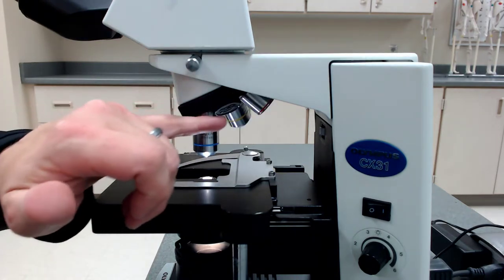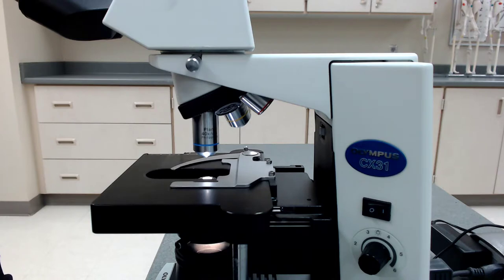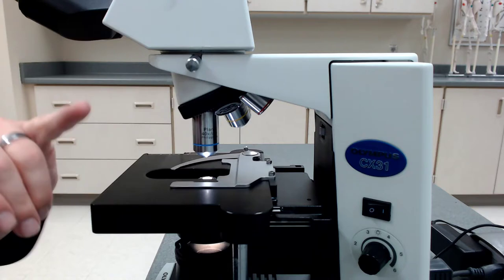So as you can see, it's been removed. But the oil immersion objective would be 100x. Sorry about that. I grabbed this microscope out of a different cabinet, and it didn't have the oil immersion objective. But you get the idea.